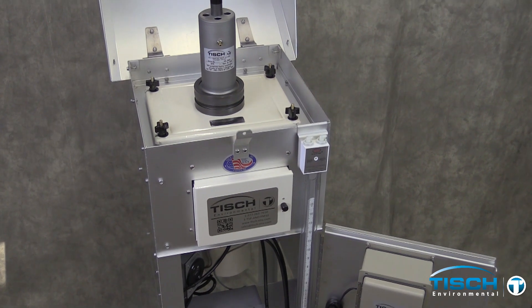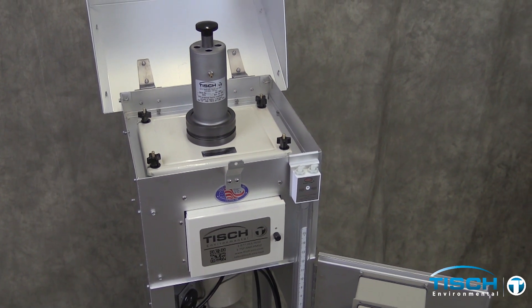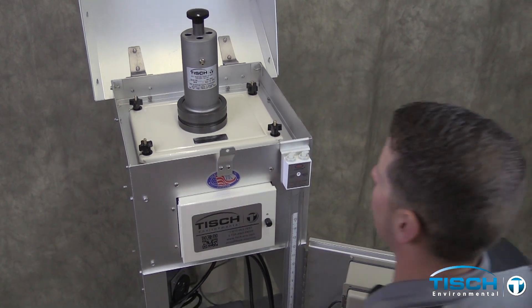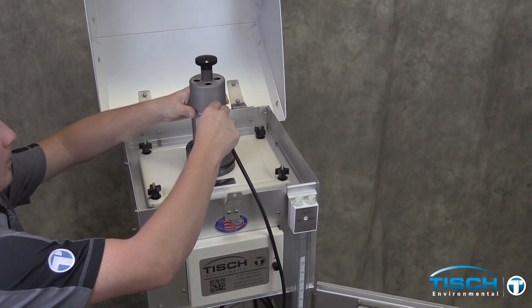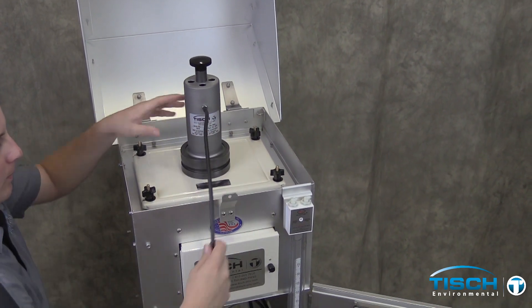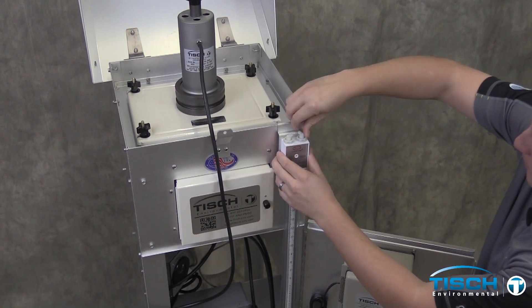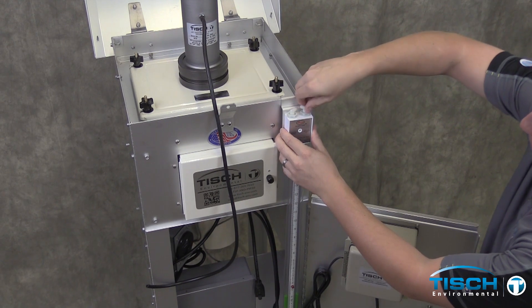Unplug the motor from the mass flow controller and plug the motor directly into the line circuit. You will need to let the motor warm up for approximately five minutes. Install the piece of tubing onto the calibrator.